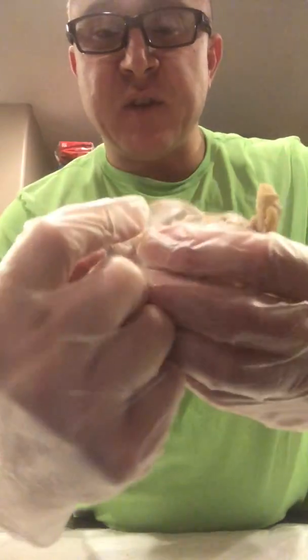The septum pellucidum is going to be slightly below the lateral ventricle, in an area like over here. Let's see, the choroid plexus, that's going to be about here, in front of the septum pellucidum.